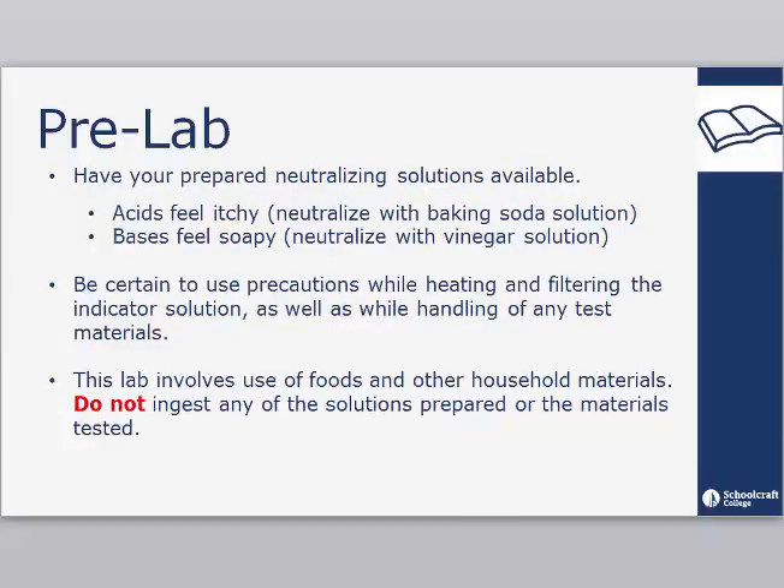Have your prepared neutralizing solutions available. Remember that acids feel itchy and should be neutralized with the baking soda solution, while bases feel soapy and will be neutralized with the vinegar solution. Be certain to use precautions while heating and filtering the indicator solution, as well as while handling any test materials. This lab involves use of foods and other household materials — do not ingest any of the solutions prepared or the materials tested.